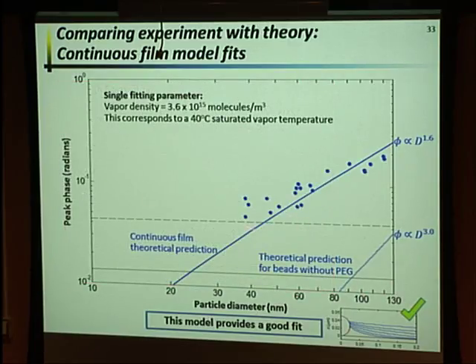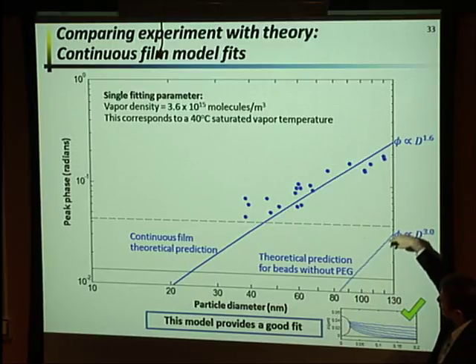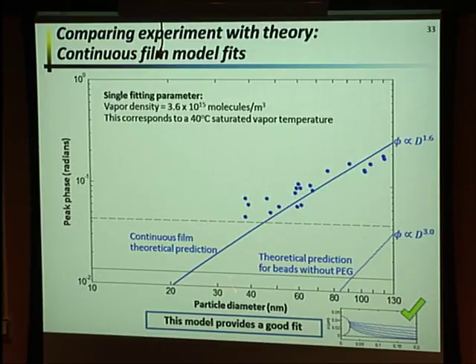One interesting thing to note is that once we add the nanolens, the scaling is a little bit different. It's no longer this d cubed, and we've actually pulled this curve. You can think of it that as this scaling relaxes, this angle comes up. One thing I should have mentioned is this is being plotted on a log-log plot, so any of these scaling parameters end up as lines. So this d cubed is the slope of this line. In that case, the 1.6 is the slope of this line on a log-log plot. And by being able to pull this line up over here, by reducing its slope, we can actually image these small particles above our detection threshold. These two lines, again, this lower line here is about the noise level of our image sensor, and this is then 3 times the noise level, which is what we're using as our practical detection threshold.